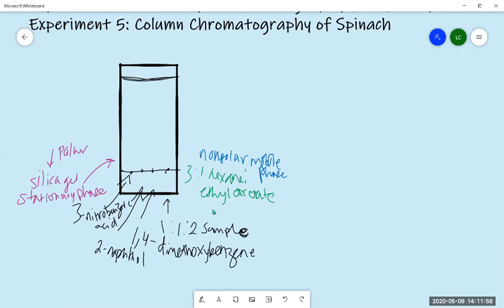So you're separating these components into each individual pure component. You don't want residue. If you see like 3 spots, 2 spots here, that means that your extraction wasn't 100% complete and you have impurities in your different samples. So you can assess how good of a separation you got in the extraction lab from doing the quantitative TLC analysis with your RF values.